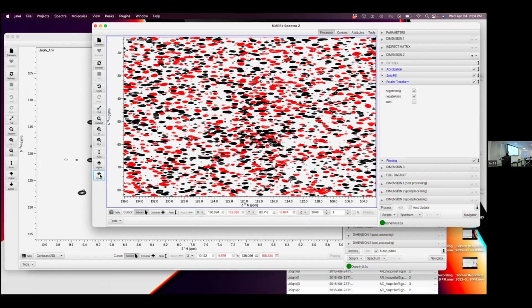It looks terrible because now the planes are proton, and I didn't get rid of the water. So there's a plane in there that actually has water. But it shows you how simple it is to flip around. You can show the data set in any orientation. Maybe I just show this data set. You could make it nicer just by doing the extract and stuff like that.